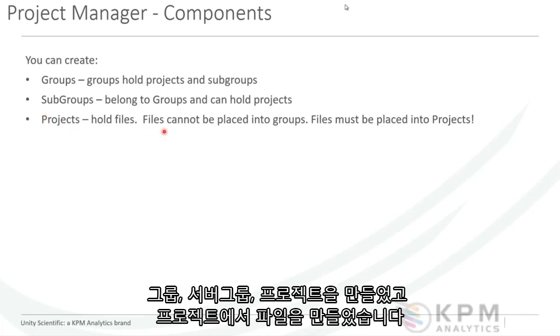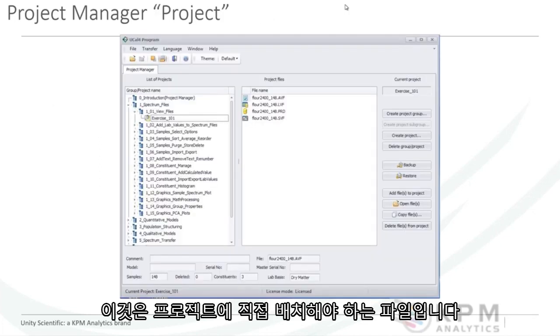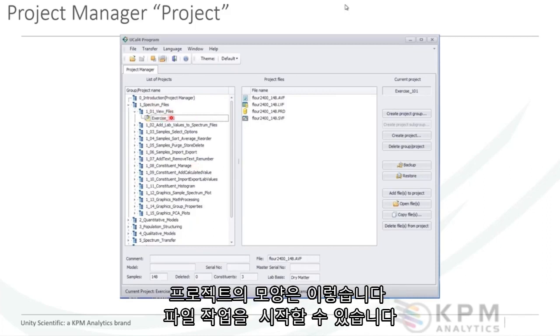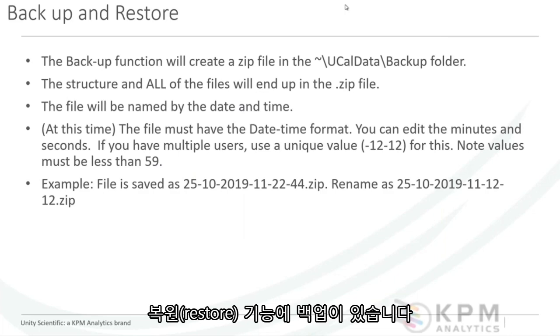And projects hold files, okay? So the files must be placed directly into the projects. And again, it looks like this. And here's what a project looks like. And you can see over on the side that it's got these files listed, and you can start working on your files. There is a backup and a restore function.